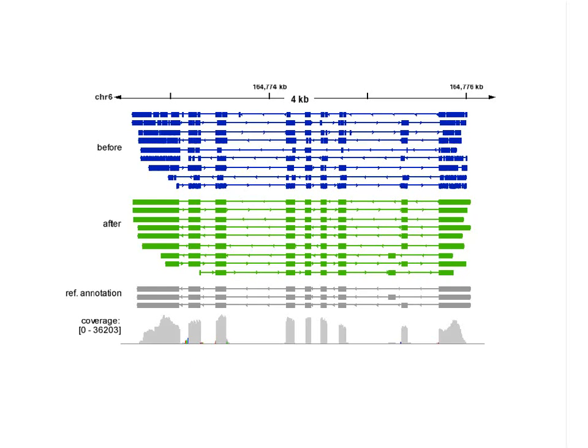Great. Three questions I'm going to clump together. I think they all touch on the same issue about AT/GC content and potential bias. One is, wouldn't you also potentially lose some areas where the PacBio was able to sequence and the Illumina was not, such as high GC? How sensitive is error correction to uneven coverage in the high accuracy reads? And Erwin wanted to know, how do you deal with regions in the genome that are underrepresented in the short reads, e.g. high or low GC regions, or regions that can't be amplified well due to secondary structures? Can you kind of talk about that?